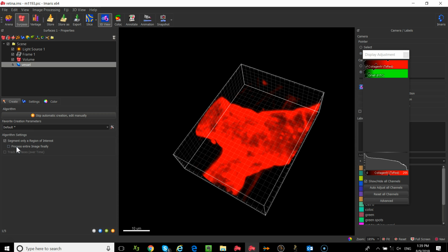Can you select that after? Like if you change your mind that you want to actually... Absolutely, yes. So the question was, can you change that? So if you change your mind, you don't want to use a region, can you go back? So down in the bottom corner here, there are 4 buttons. One is a back arrow, one is a forward arrow, one is a green finish arrow, and one is an orange cancel. Not an arrow, button, sorry. And these allow you to navigate through the Creation Wizard. So if you go forward and then you're like, I don't want a region, and you want to go back, you click on the backward arrow.